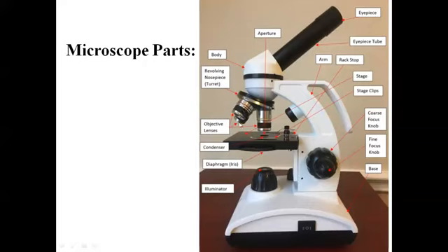These are your objective lenses, depending on the type of microscope that we are using. The objective lenses will vary in number: three, or at times four or five. Here we can rotate this piece and, according to our requirement, set up the magnification. That is one thing.